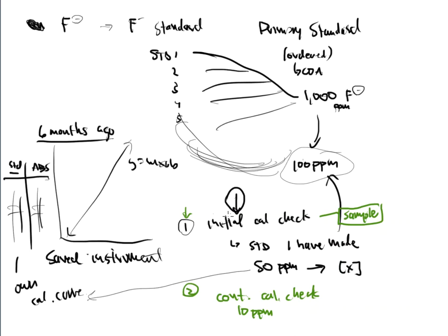Now, some software systems, well, they've got multiple menus for you to identify samples and calibration checks and quality control parameters, but I'm keeping it simple. I don't want to bog you down with that detail. All right, so we're going to run this like we do all the other samples. If I make a 50, it should come out to be a 50.